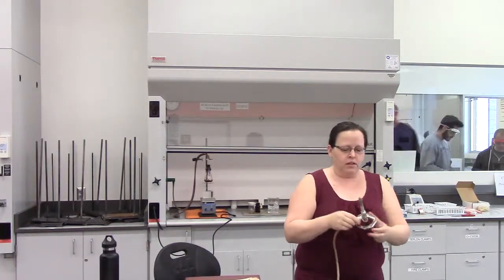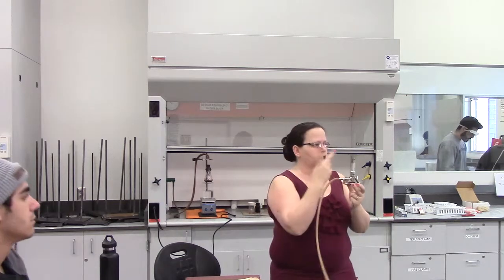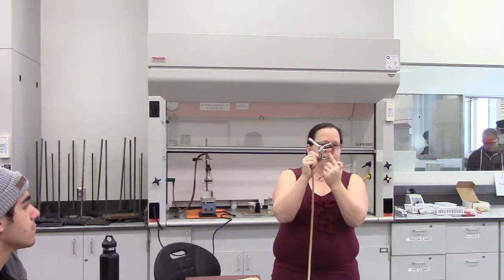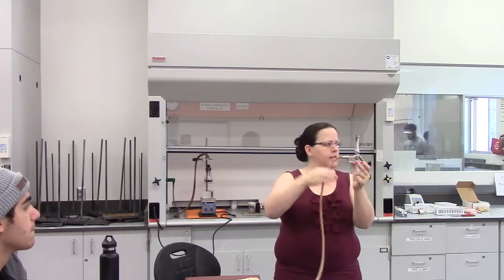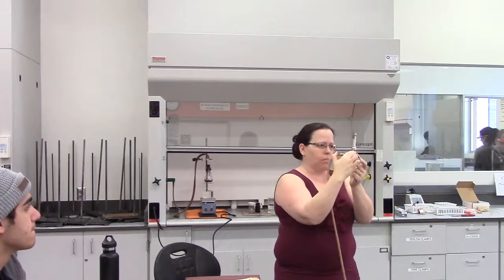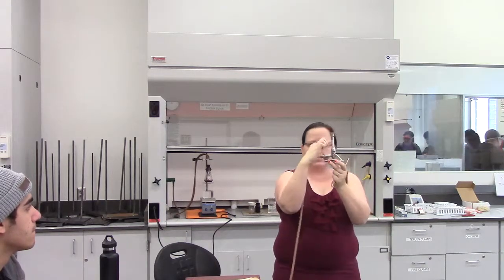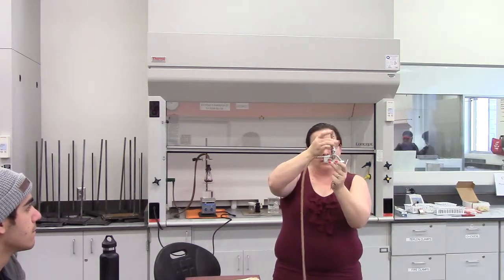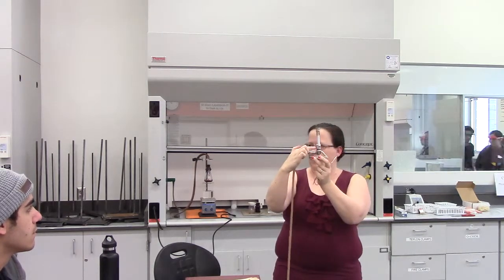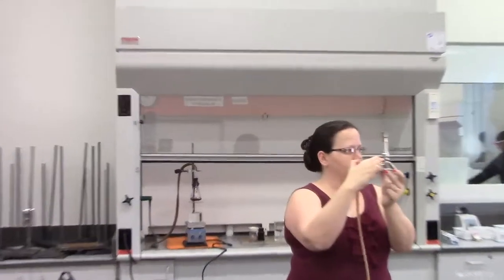Okay? When you go to light a Bunsen burner, there are 2 adjustments you need to make. One is this dial on the bottom. This actually regulates how much gas comes from the tube up to your burner. The other one is this little opening right here. If you grab the stem of the burner and twist it, can you see how a little opening opens up right there? That's letting oxygen in.